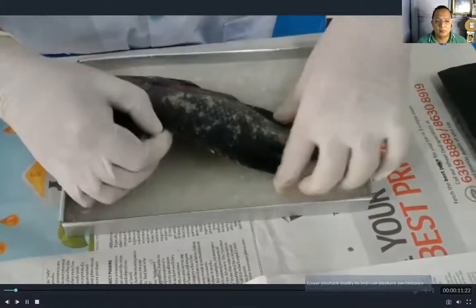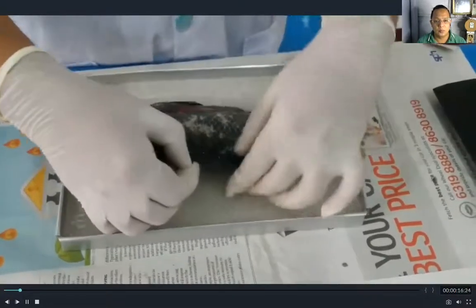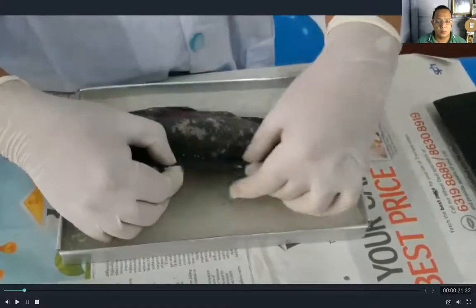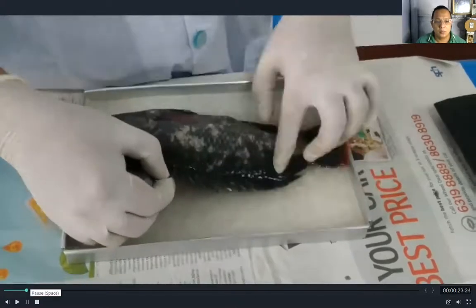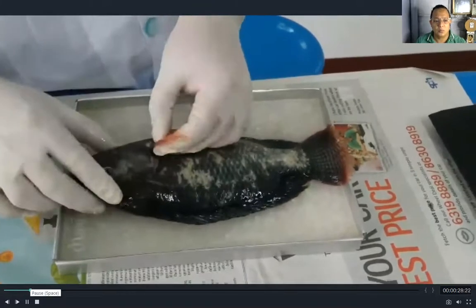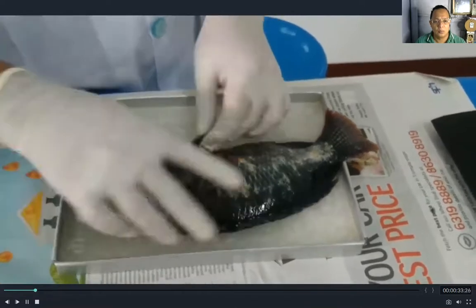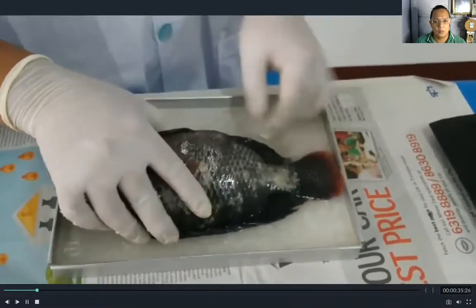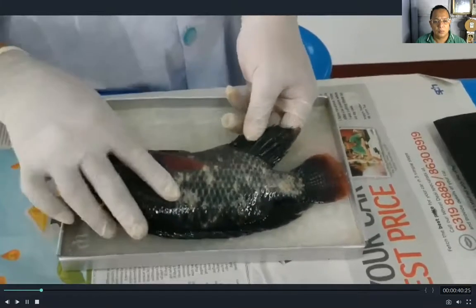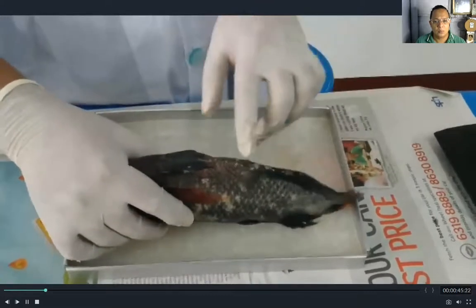And then we have the fins. Fins help the fish with buoyancy in water. This one is the dorsal fin. And then this is the pectoral fin. And then this is the pelvic fin. And then this is the anal fin — it is called the anal fin because it is near the anus.